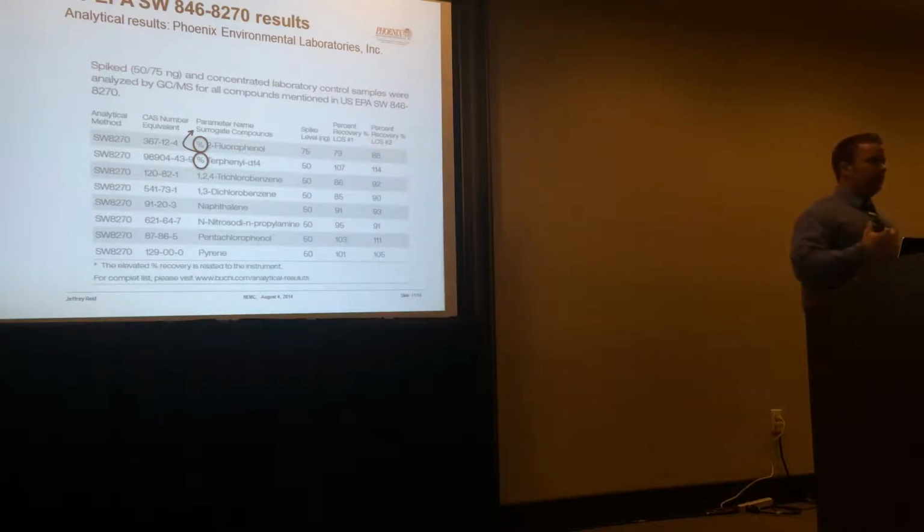A lot of it is based on controlling your results, manipulating the solvent pressure, the actual vacuum setting, the rotation speed, so you can achieve high reproducible results. You can see here, the 8270, again, it's a list of about 80 plus compounds. Here's your common ones here.